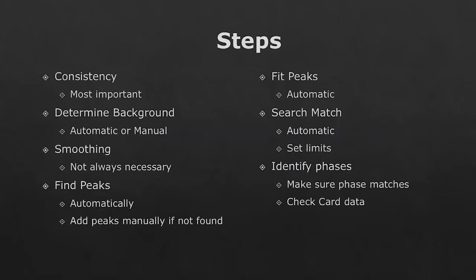So basically what we're going to start off today is we're going to talk about HighScore demo. This is going to be for phase identification. This is after you do analysis, and you can use the data coming from the Rigaku or the Empyrean for this.